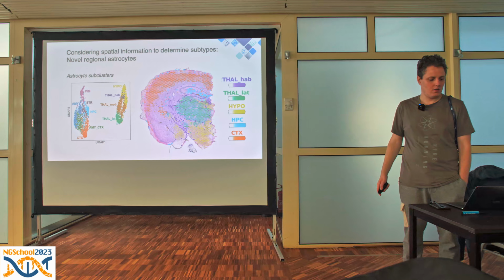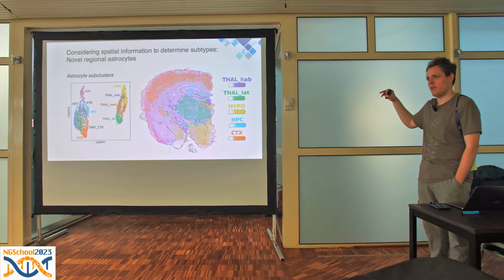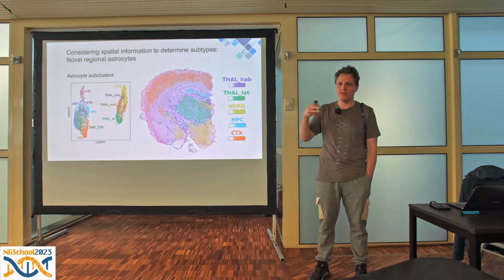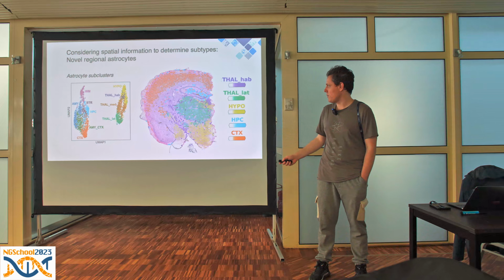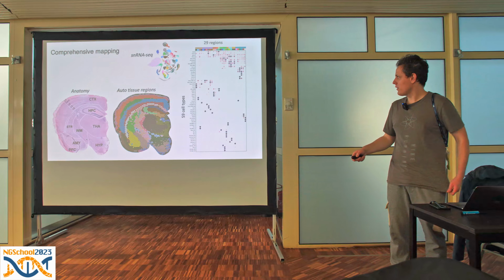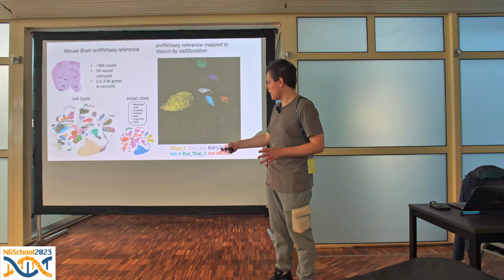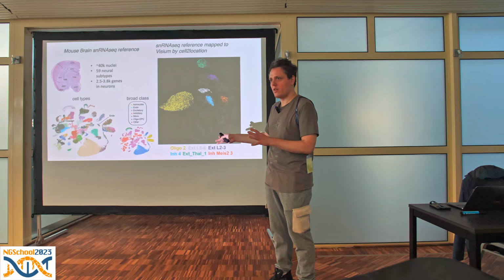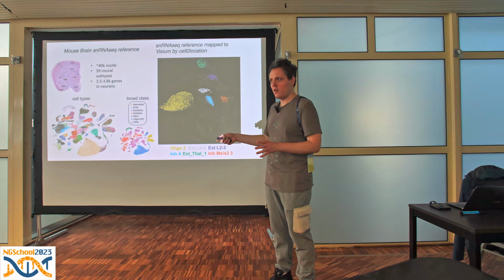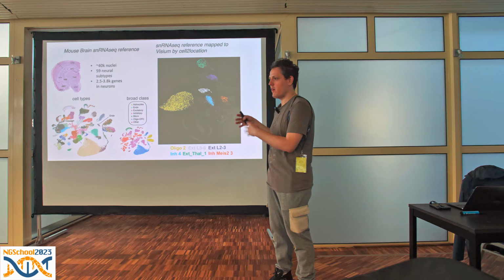Okay. So hopefully this example illustrates that you can use spatial information to help define subtypes, as well as how to approach systematic mapping. Systematic mapping differs from non-systematic in the sense that you can annotate your cells first and then do mapping, and your annotation will be based on what you know about the tissue. Whereas the systematic approach is that you just isolate all transcriptional differences, you map them, and then you annotate.